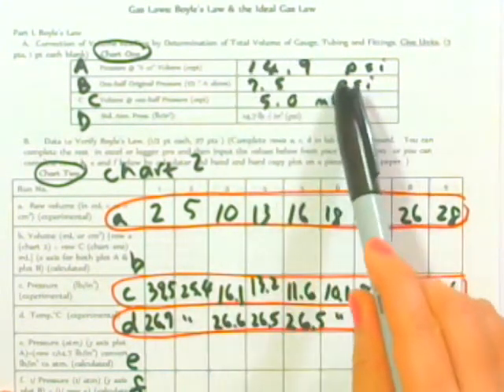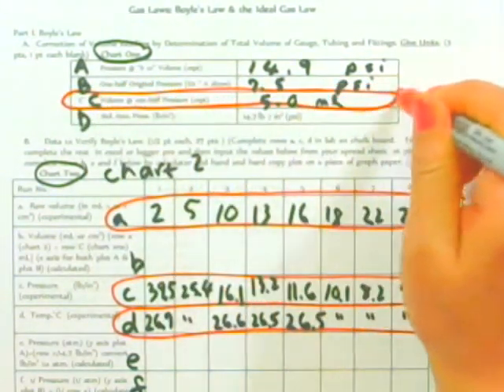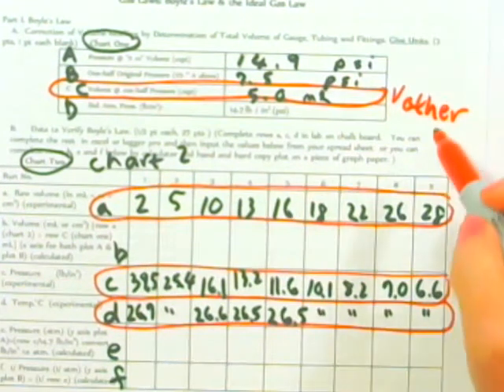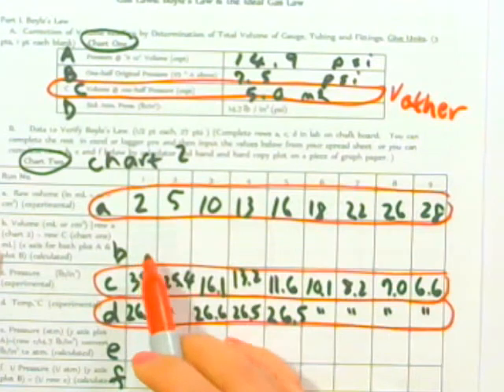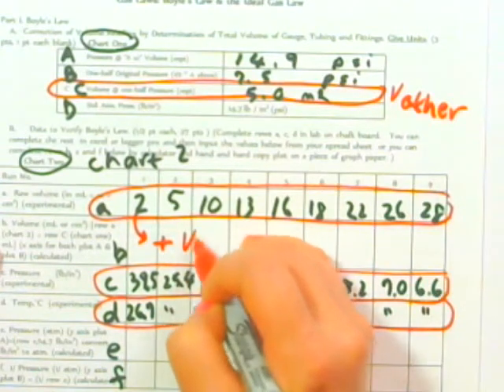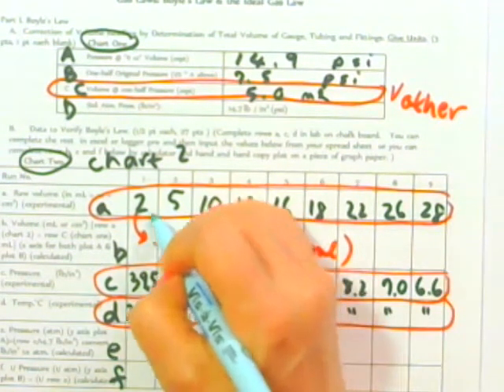But you're going to actually use this volume, the volume that you have in C, this is the volume other. So you're going to have to add this to all your other volumes. So this is the volume for the actual volume that you're measuring. What you're going to do is take this volume up here, and then add to it volume other. And what's our volume other? In this particular case, our volume other is 5.0 milliliters. So all of the numbers above, you're going to add 5 milliliters to come up with the number that goes into this part of the chart.